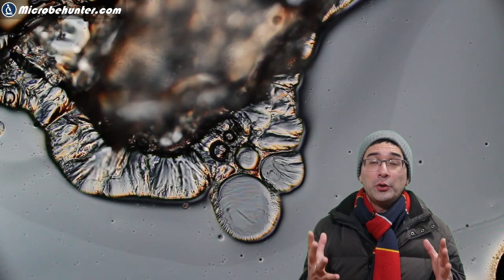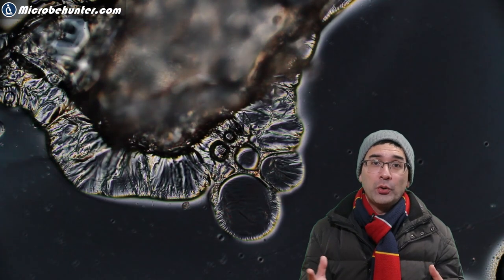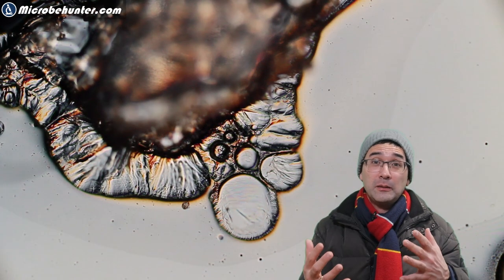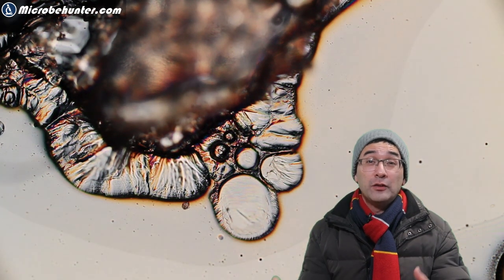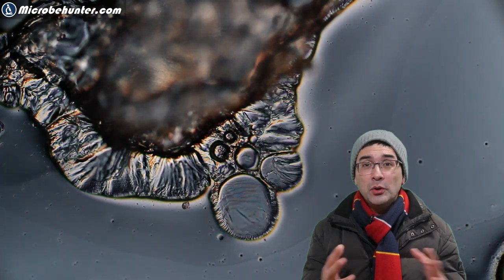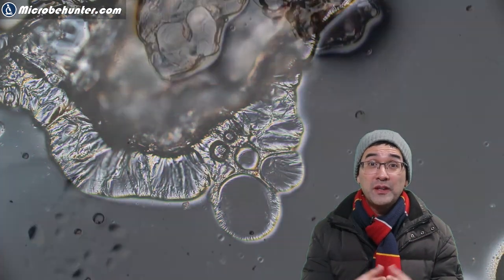Of course not all crystals look very nice. The majority of them here there were air bubbles and it kind of looked a little bit irregular. I think the snow melted and then refroze again. That's why I'm not seeing very nice structures in most cases.